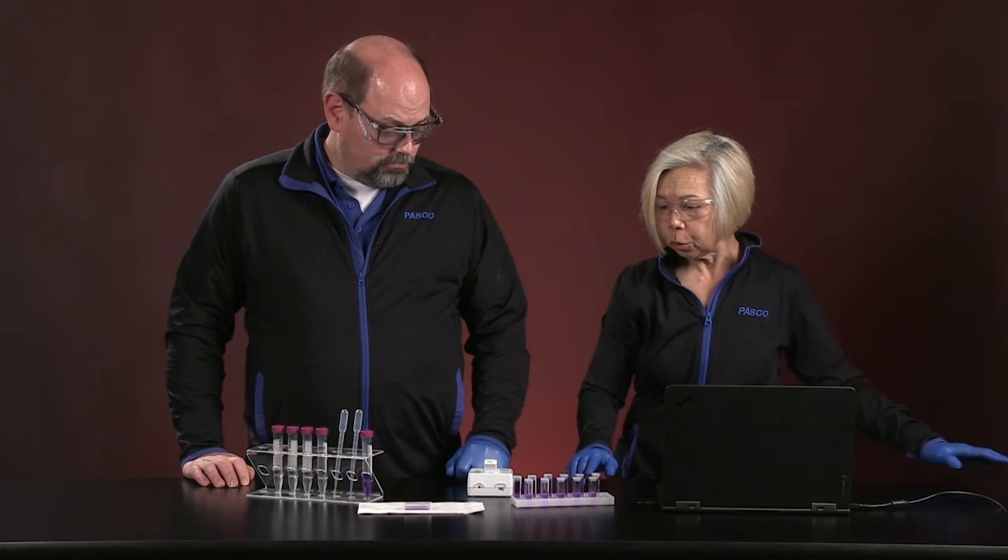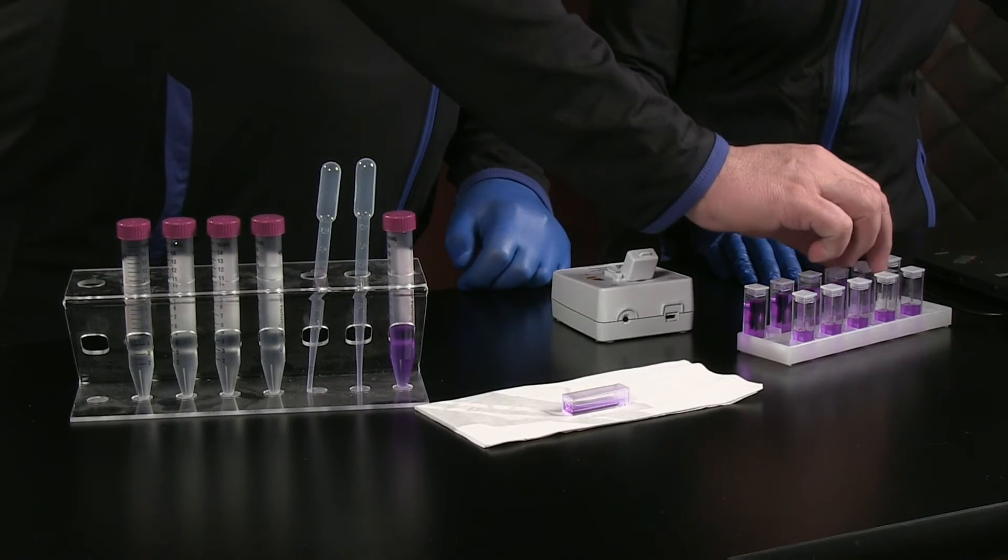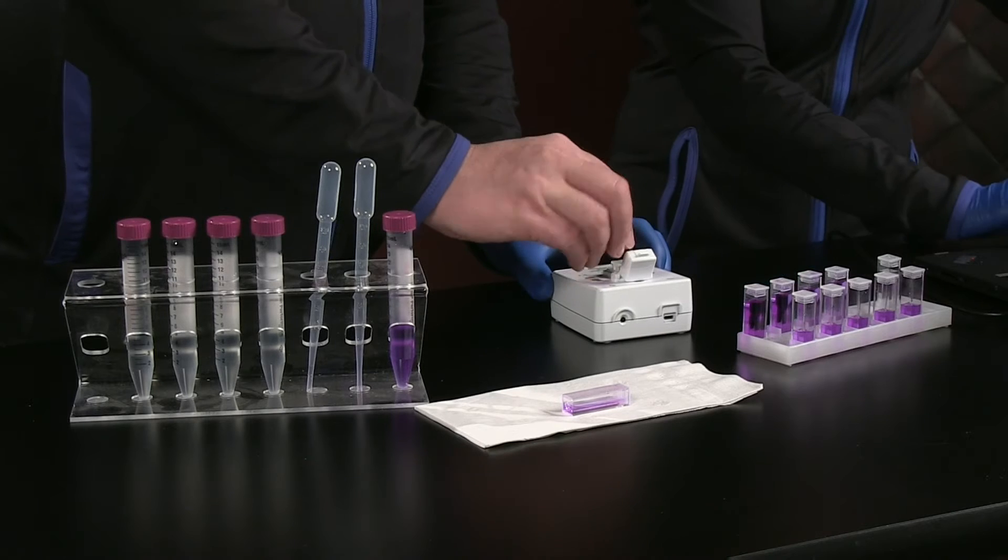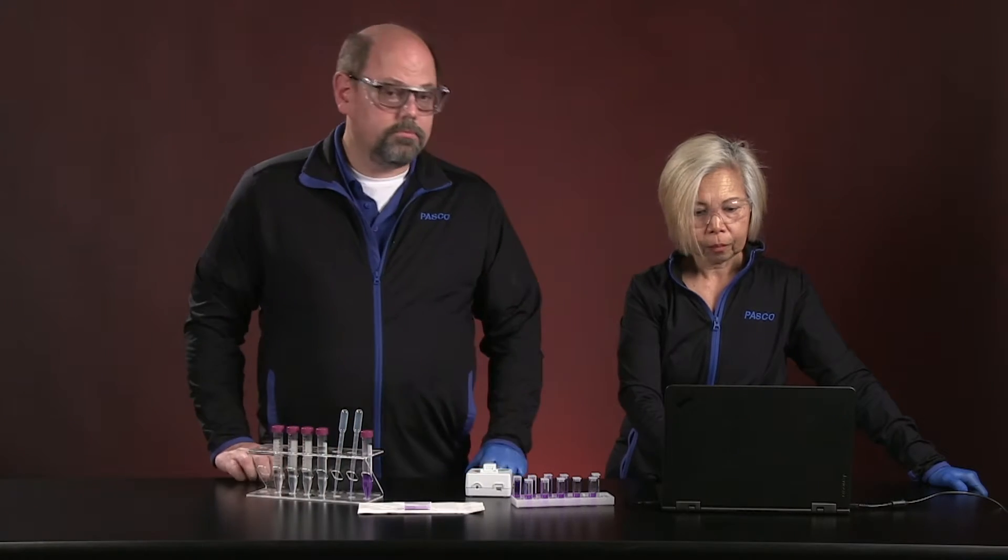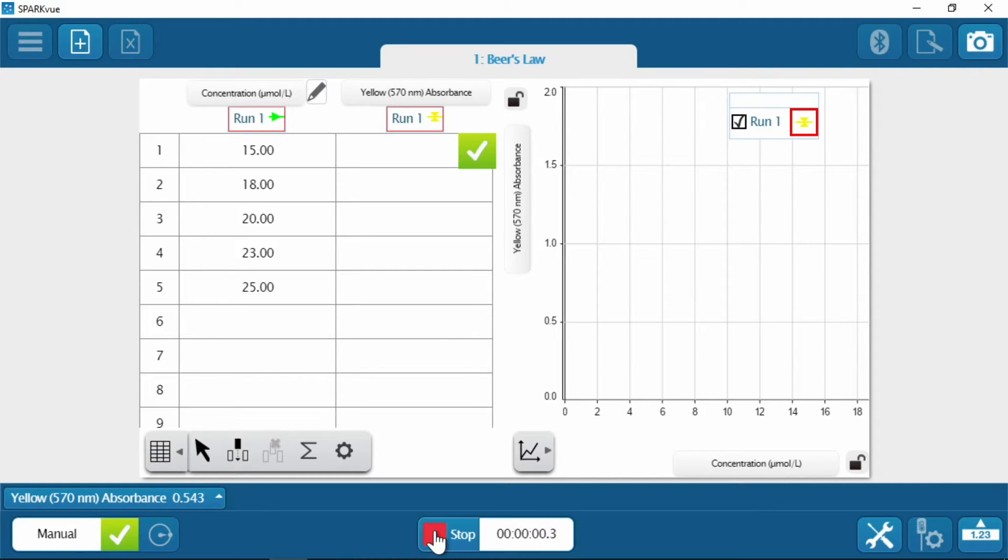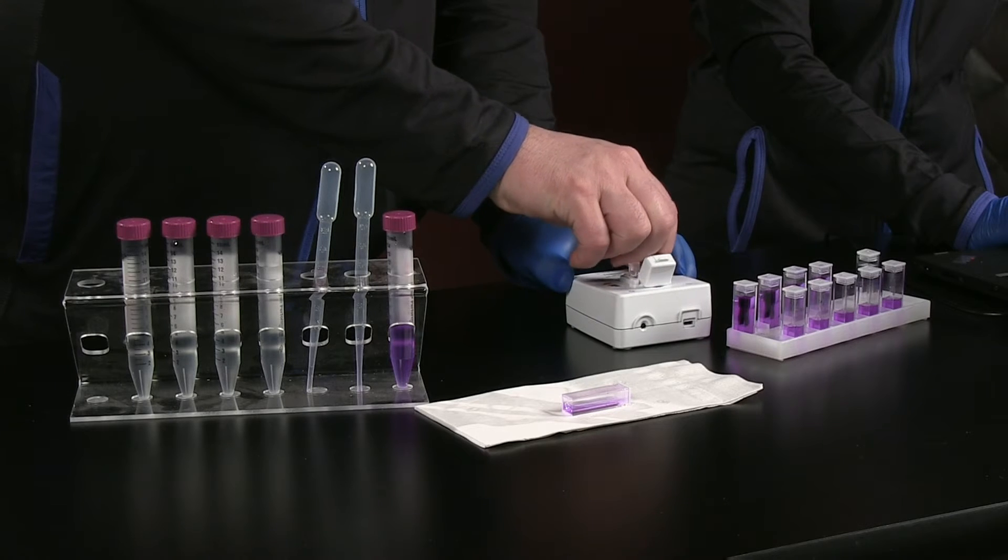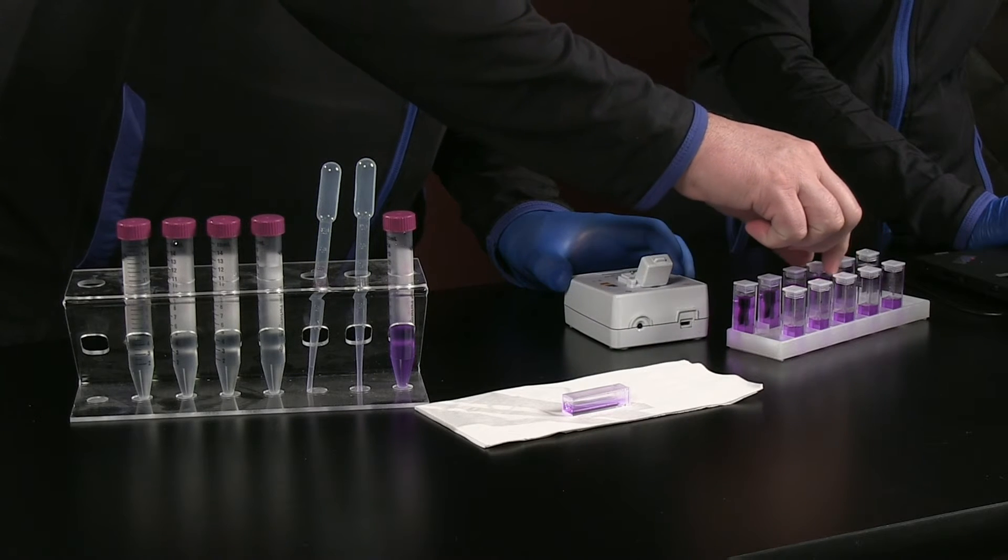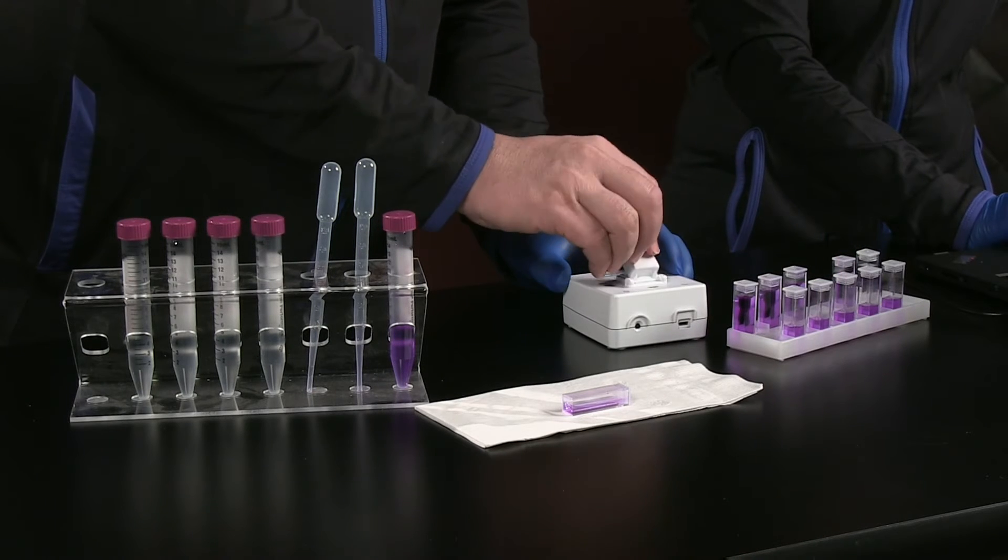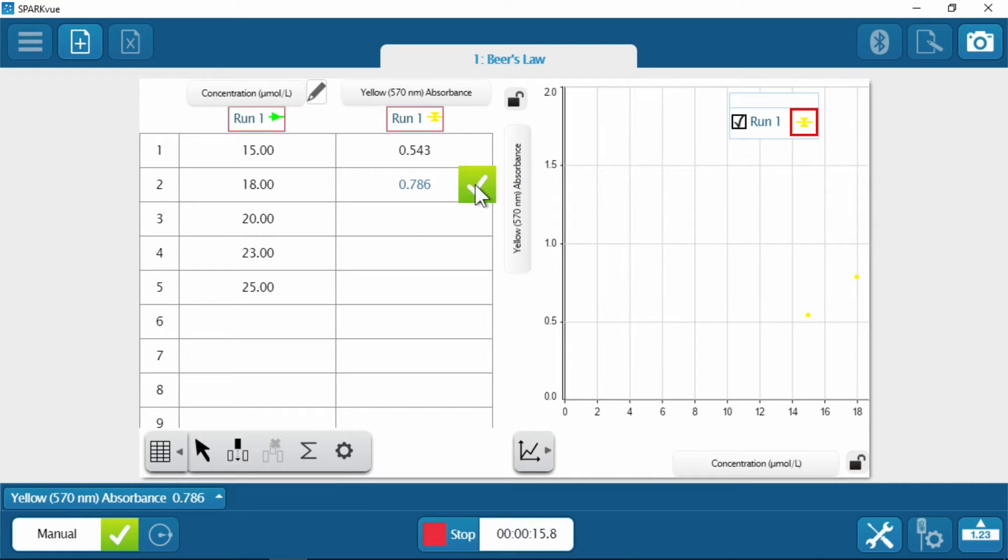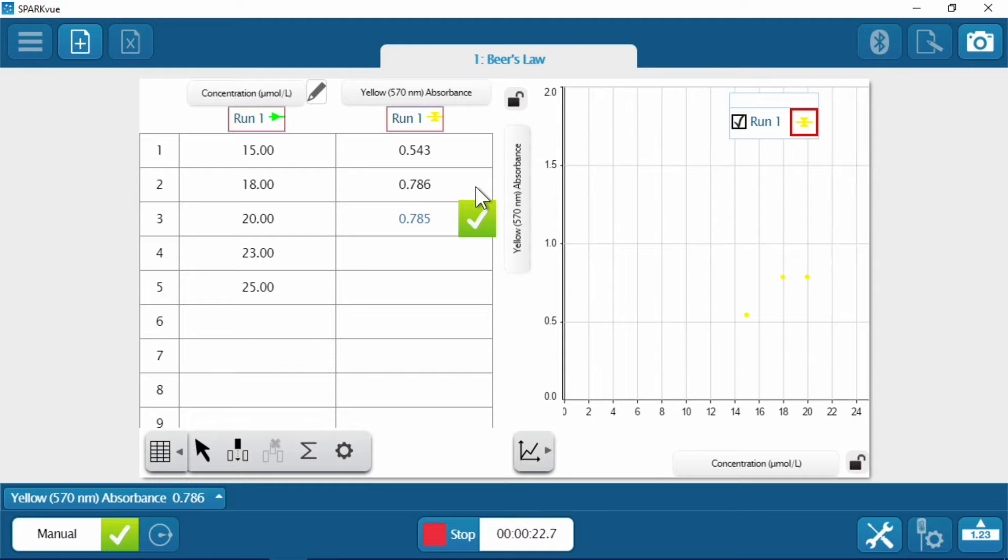So shall we get started? Let's do it. All right, so why don't you put our lightest sample there, which is 15 micromolar. 15 micromolar. This is the absorbance of 15 micromolar. Let's try the next one up. This is the absorbance of 18 micromolar.